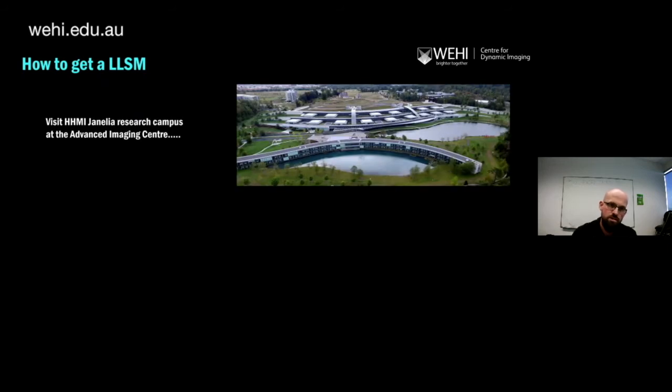So at the time, there were a few ways that you could get your hands on it. One, you could take your research to Janelia Research Campus, where the system was invented, and you can run your experiments there. And that's a great experience. It's like a Disneyland for microscopists. So I still haven't been. Kelly and Lockie have been many times, and I'm not bitter about that. Oh, I am a bit.